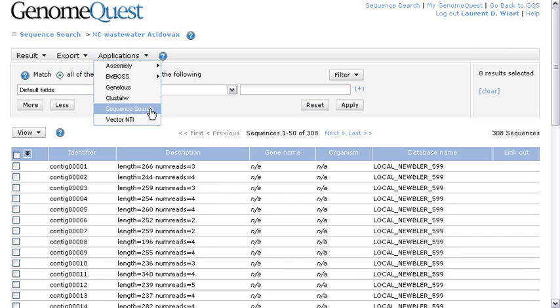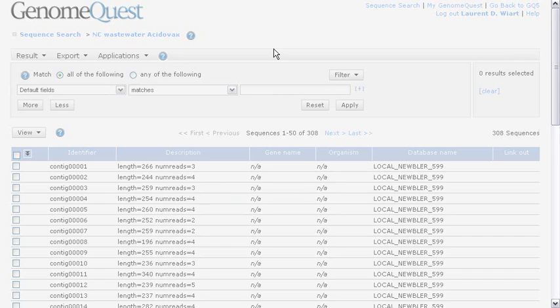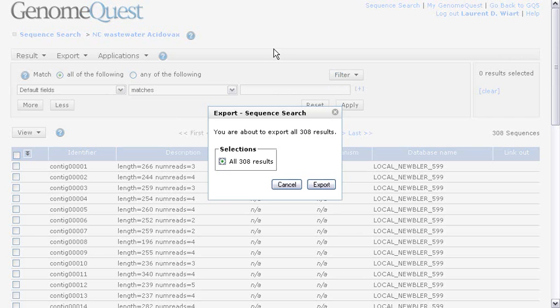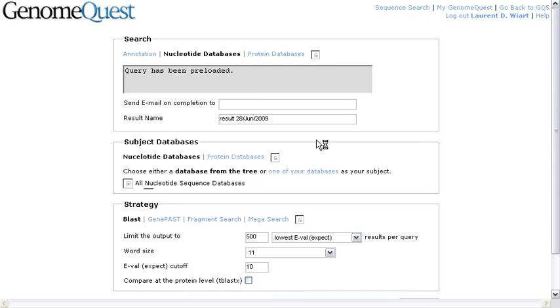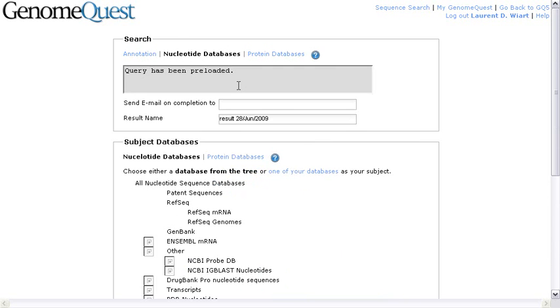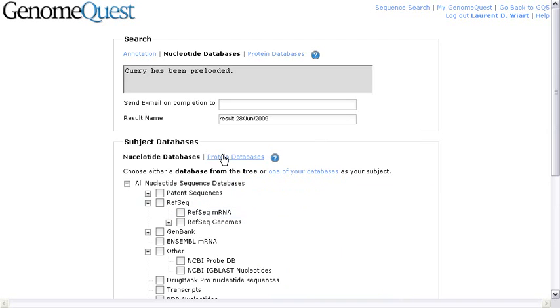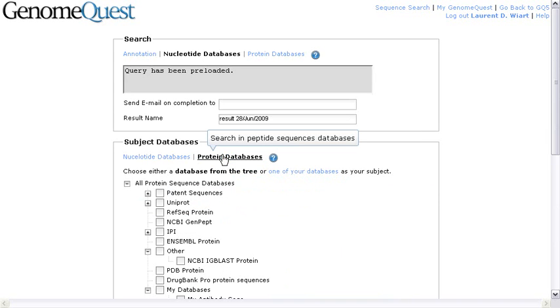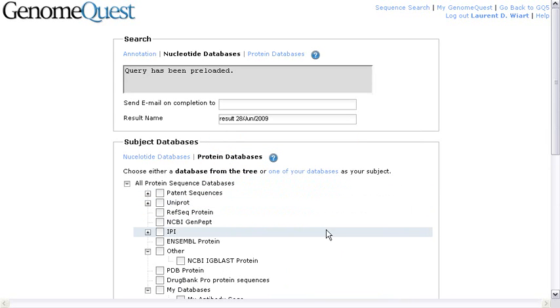For example, go to the sequence search page of GenomeQuest to compare those contigs to other databases. For example, perform a BlastX and compare to some protein databases. And now the new page is loaded, and as you can see, we can compare those nucleotide sequences preloaded to other databases, which could be protein, for example, Uniprot, RefSeq, etc.